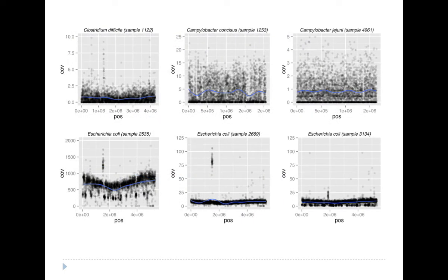So then we looked at a range of samples, and what we agreed with our German collaborators was that we would look at some samples that they knew were STEC positive, but we'd look at some other samples that they'd isolated, taken at around the same time during the outbreak, from patients with diarrhea, but where they didn't have STEC, but had another pathogen instead. And so we then aligned against various reference pathogens, and we got these kind of plots.